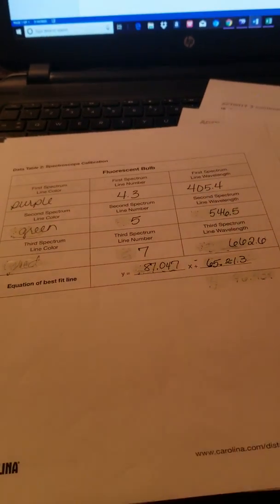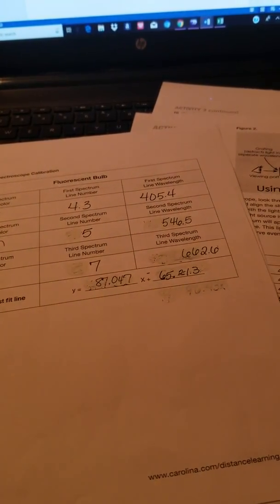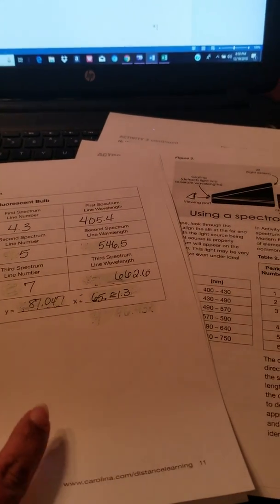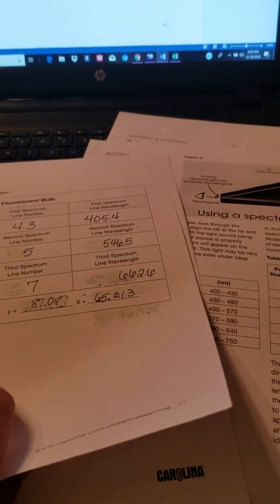Then I took the information that I got from there and put that on the data table for the spectroscope calibration. And I took this information and plotted it onto a scatter graph that I have over here. With that information is how I got the equation for the best fit line. Very important to end up getting that because you will need that to complete the next table, table 3.